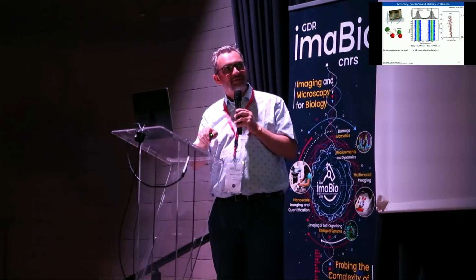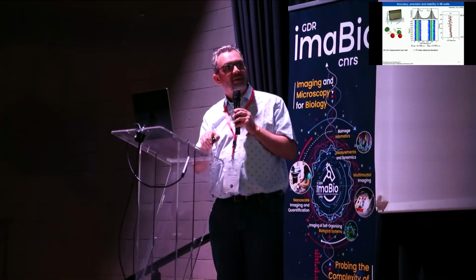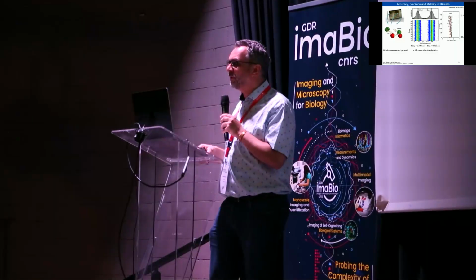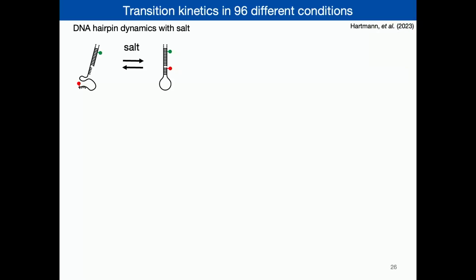But in this case, it basically means we don't have any evaporation problem, we have control, and we can measure for 32 hours with a stable instrument. And I don't show you all the experiments that are described in the publication. I would like to point out a few.